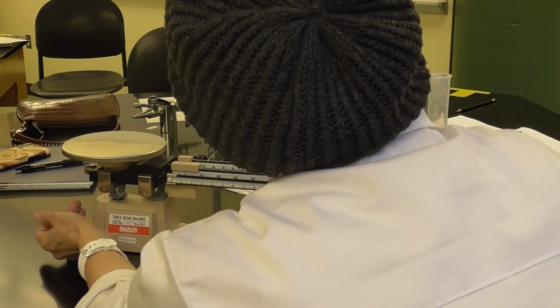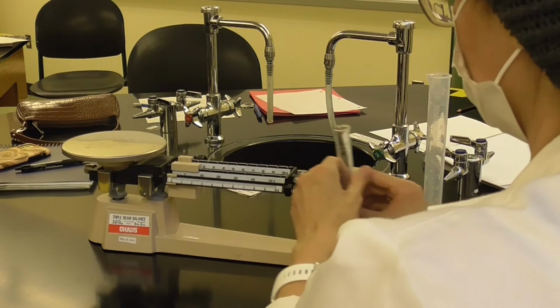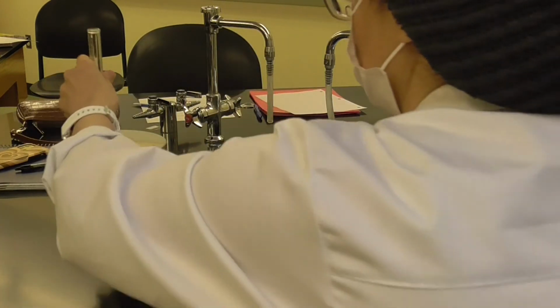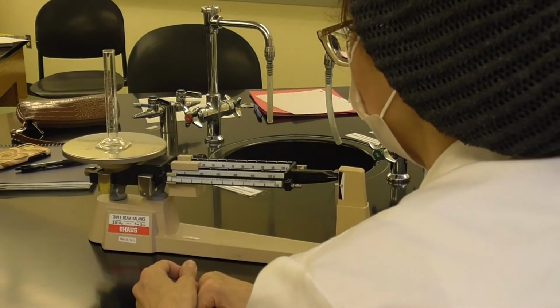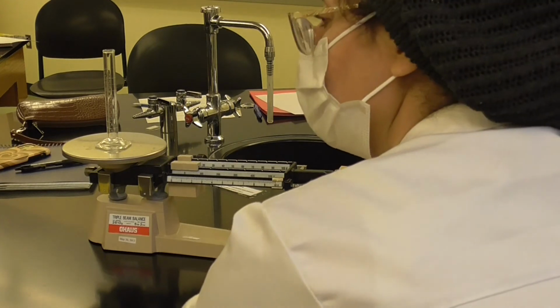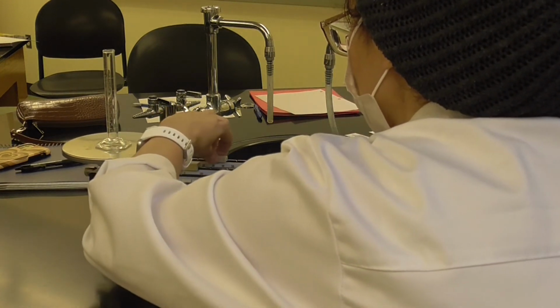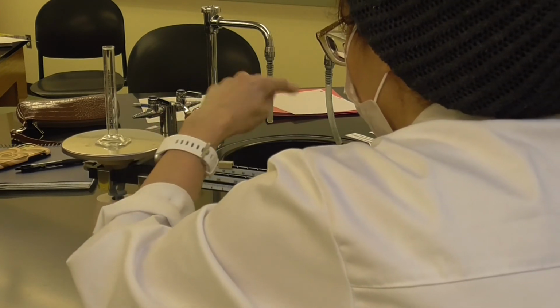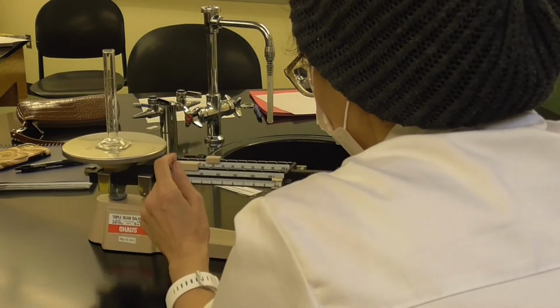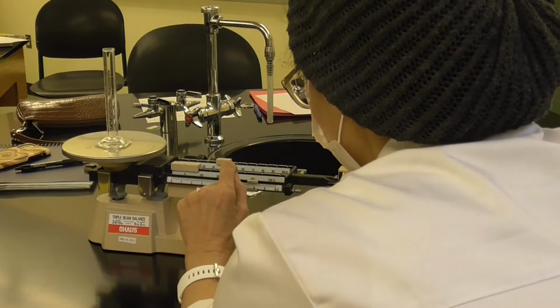Alright, so this is almost like with the zero. After you do that, it should be on the zero, and everything is on zero scale, nothing is changed. You're going to put that one here, and then usually we will move the 10. If it doesn't move, I will put the other, go into 100, to another 10, 20, 30, 40.